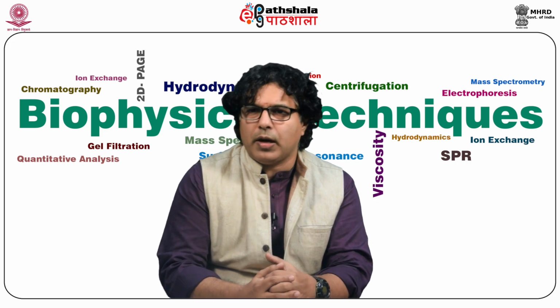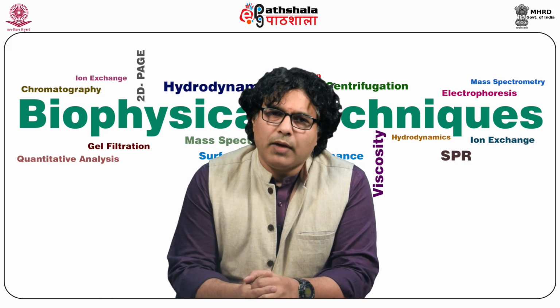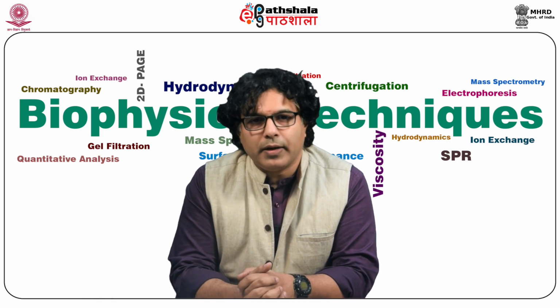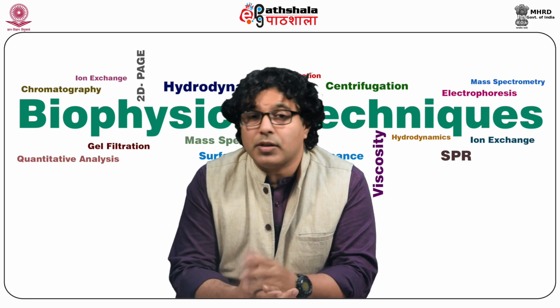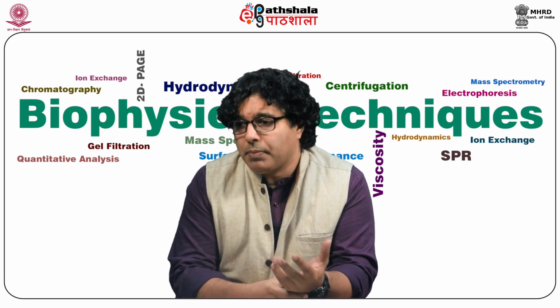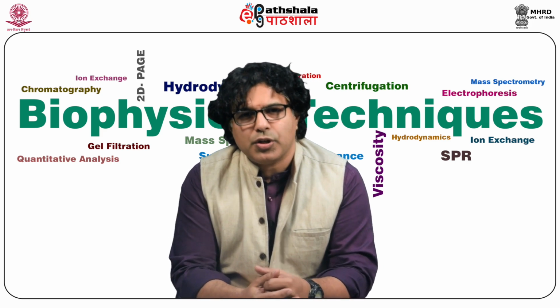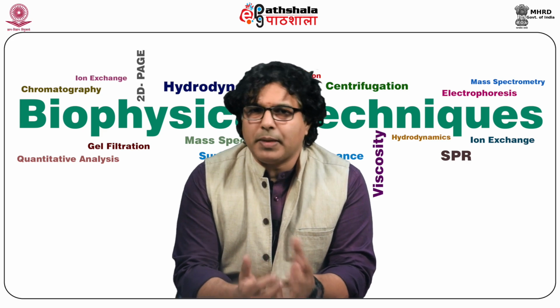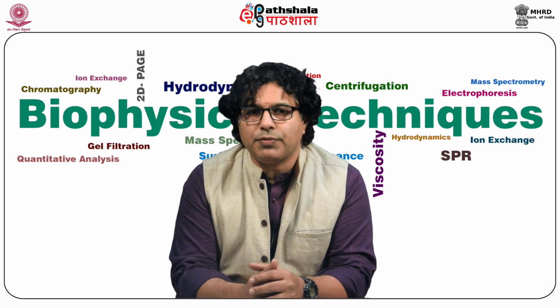Centrifugation is popularly employed for removing particulate matter. Filtration or ultrafiltration is employed to get rid of solid matrix. For example, when you work with bioreactors containing the inoculum, you want to get the ultrafiltrate from the inoculum to do the analysis. Here you use ultrafiltration techniques.